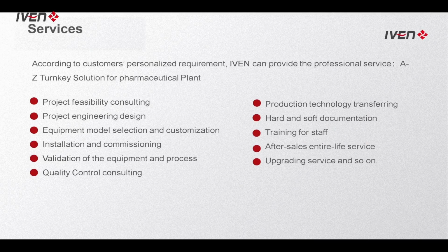Starting from the consulting service, the feasibility study, the project engineering design, the equipment model selection and customization, and also the full set of GMP, the after-sales service, and upgrading service also.